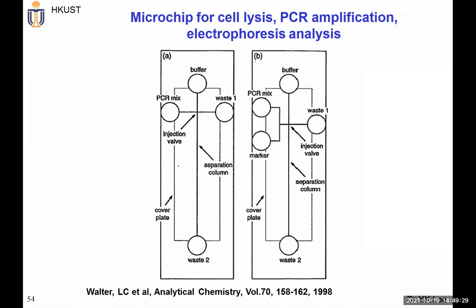As I just mentioned, you can see that in 1998 people already had this idea, but unfortunately it really takes time to make this kind of integration. So it's still non-trivial from my point of view. But this idea is gradually becoming a real product. I will show you a recent product launched by IMEC in Belgium, working with Johns Hopkins University. They really do this kind of integration and make a real product now.